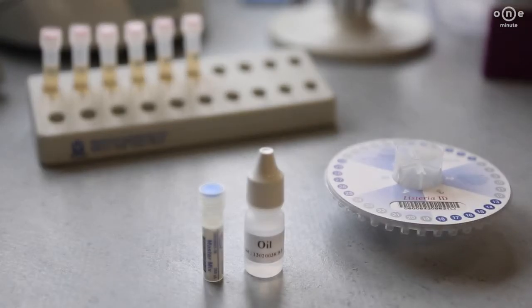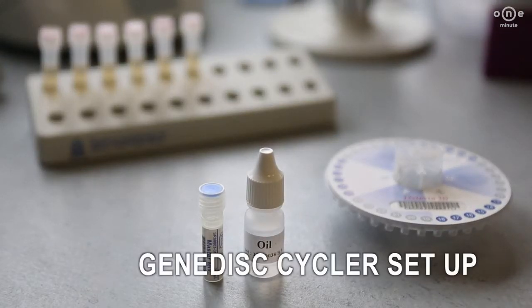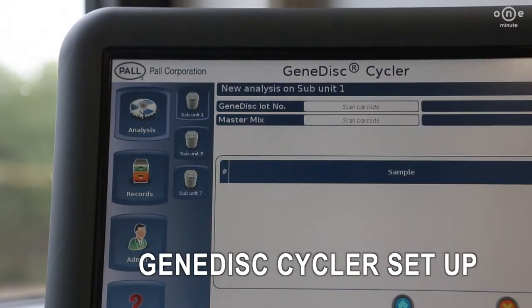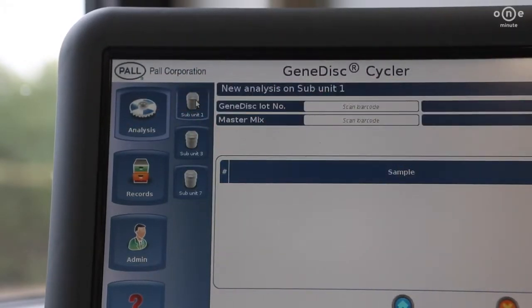It is very easy to run a real-time PCR on a GeneDisc Cycler. All you have to do is follow the instructions on the screen. Choose analysis on the cycler unit and then let the instrument guide you through the following steps.